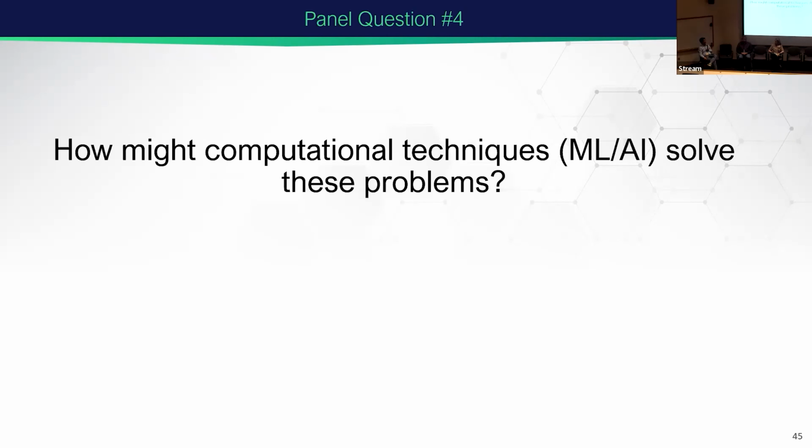It is the same thing for machine learning. There are many different machine learning algorithms. We have to train each of them differently, based on your samples. People just go, okay, random forest works best for me, and there is no rigorous judgment of why it is better.